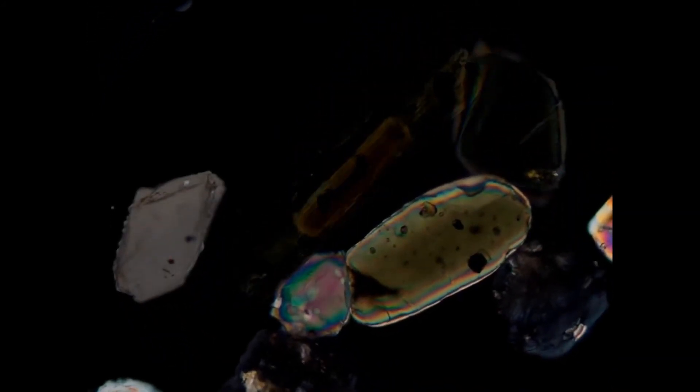The prismatic shape in combination with a large extinction angle point towards a clinopyroxene. And because of the strong green color, one would probably call this an augitic clinopyroxene. Welcome to the Muirr.